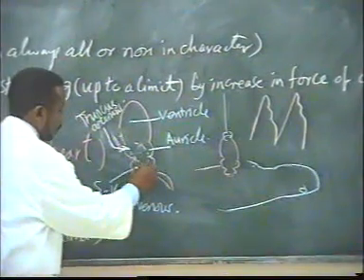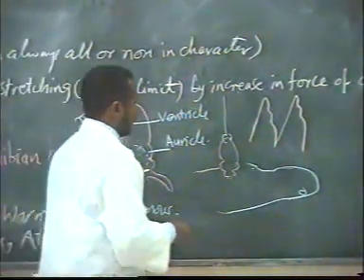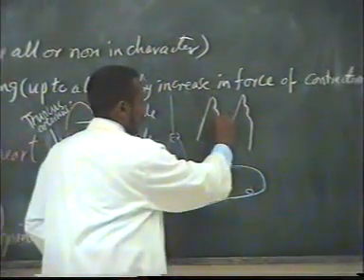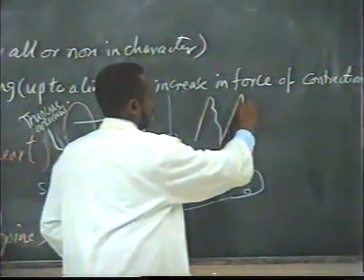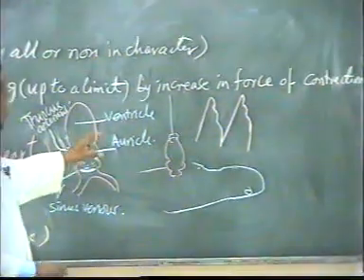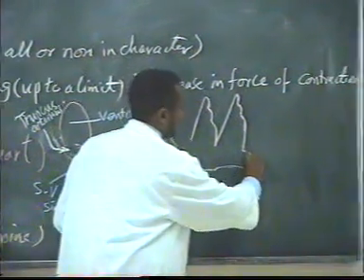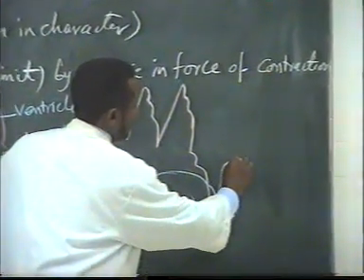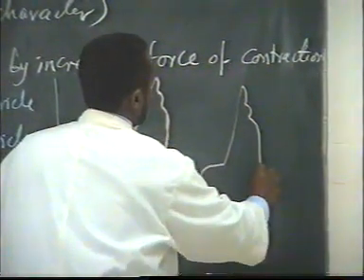So the initiation of contraction always starts at the sinus venosus, in this area, and after that comes the contraction of the auricle and the ventricle. Relaxation, then another contraction cycle, like that. If we stimulate the heart at any time, we get an extra systole, like that. And there is a pause, and the heart again starts contracting.